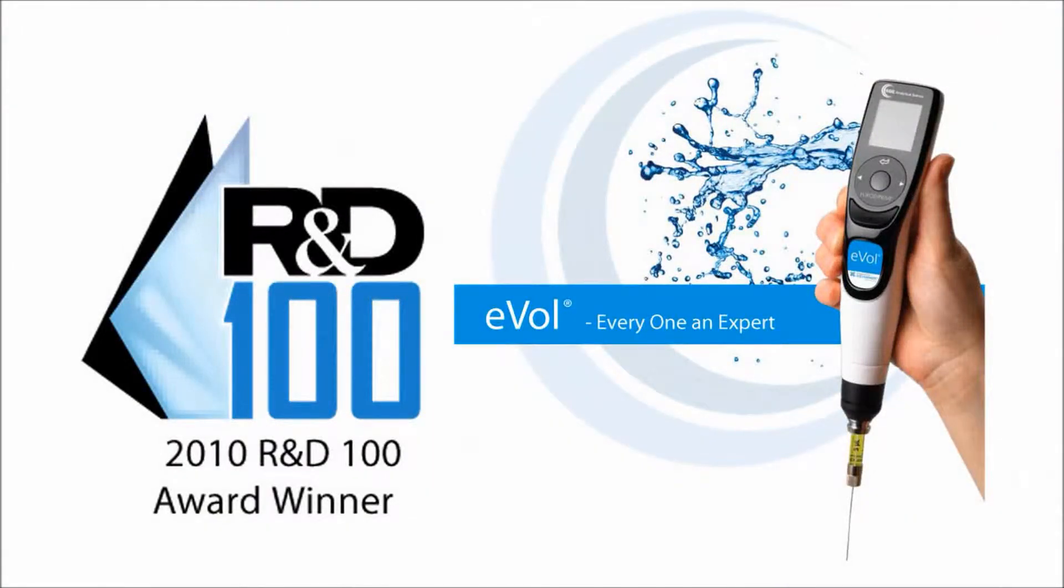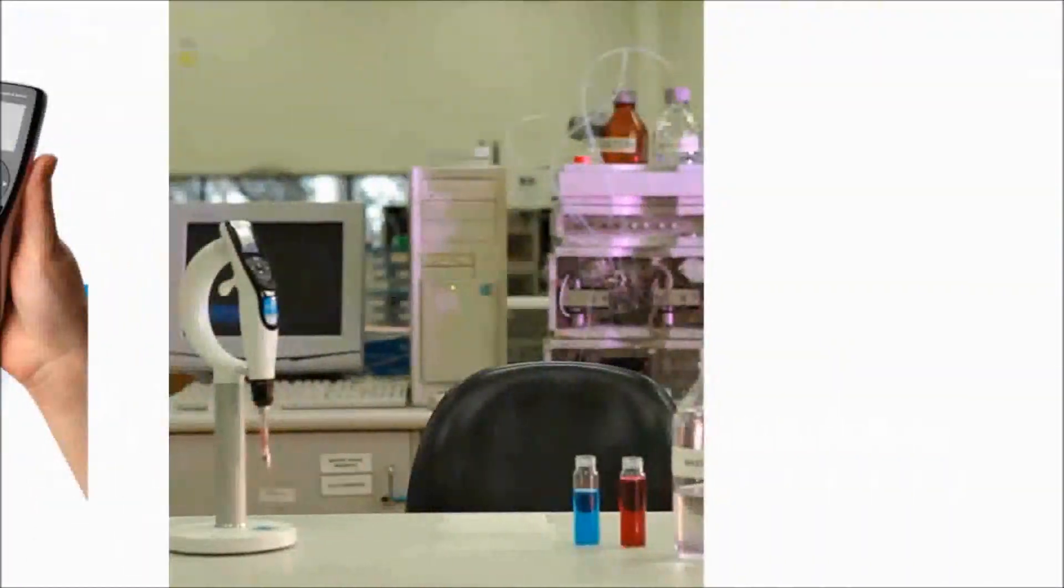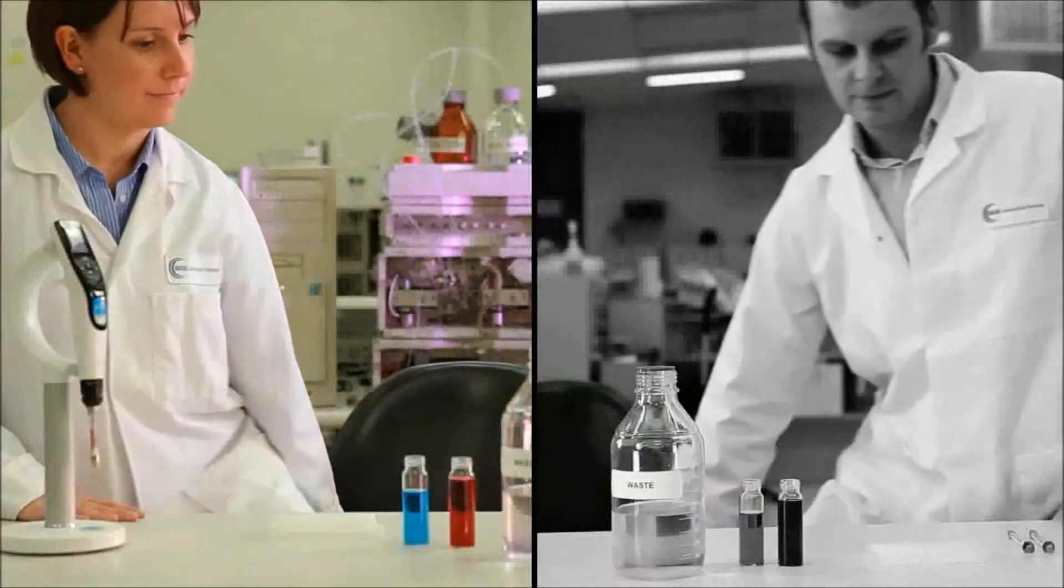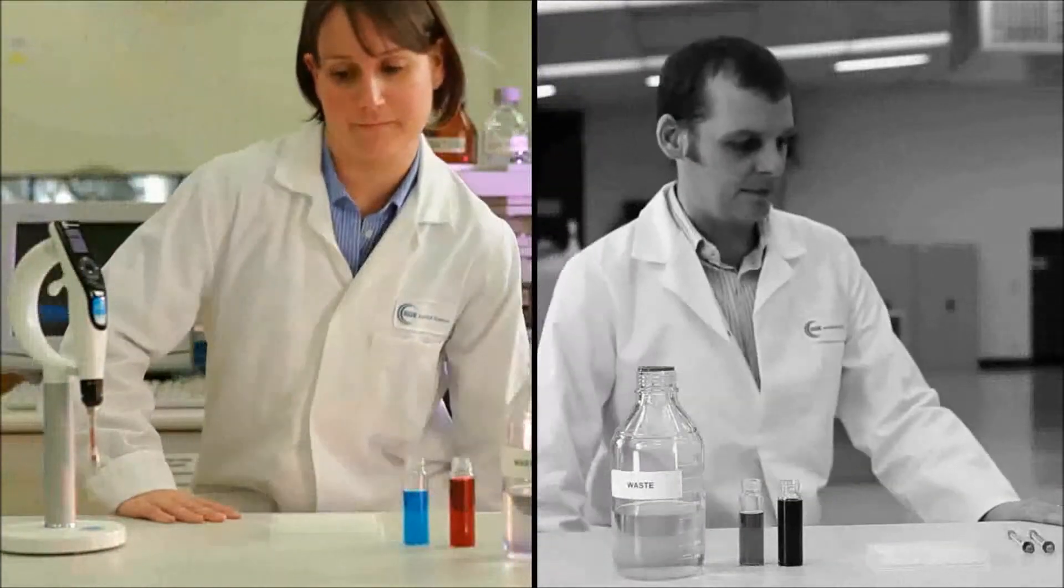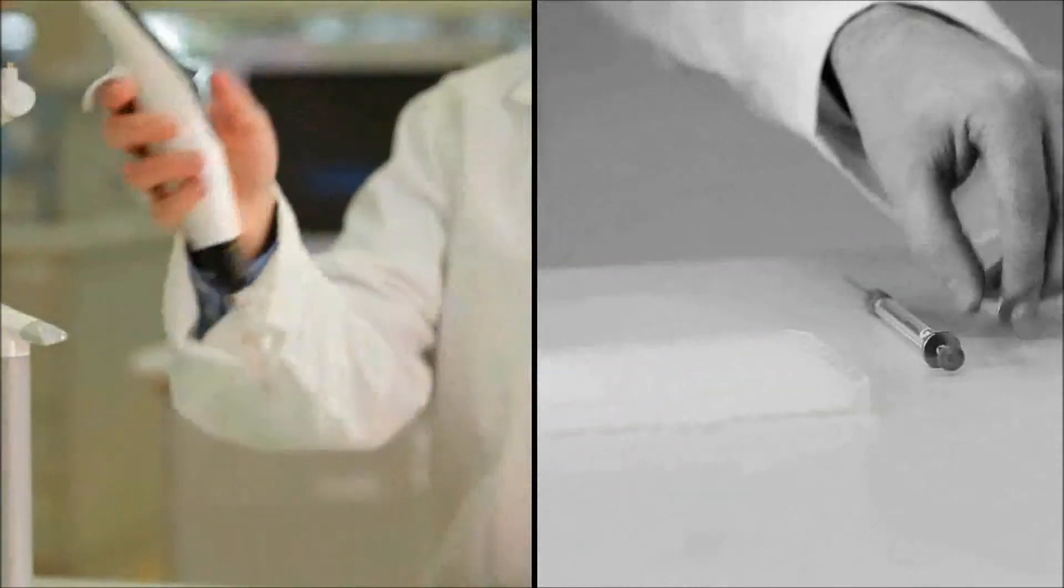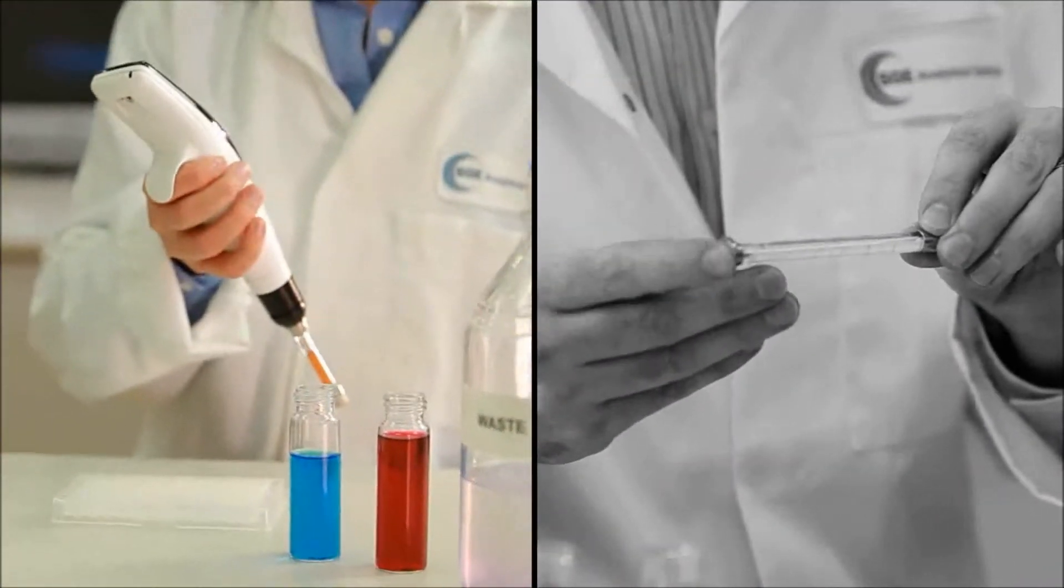On top of improved accuracy and reproducibility, the award-winning EVOL improves and simplifies the pace of laboratory processes. Observe as Catherine and Mark perform a serial dilution. Catherine is using the EVOL automated analytical syringe. Mark is performing the dilution manually.